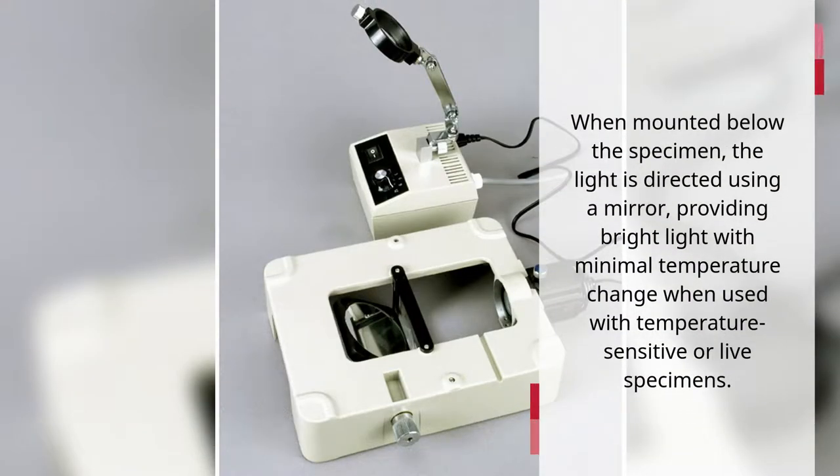When mounted below the specimen, the light is directed using a mirror, providing bright light with minimal temperature change when used with temperature-sensitive or live specimens.